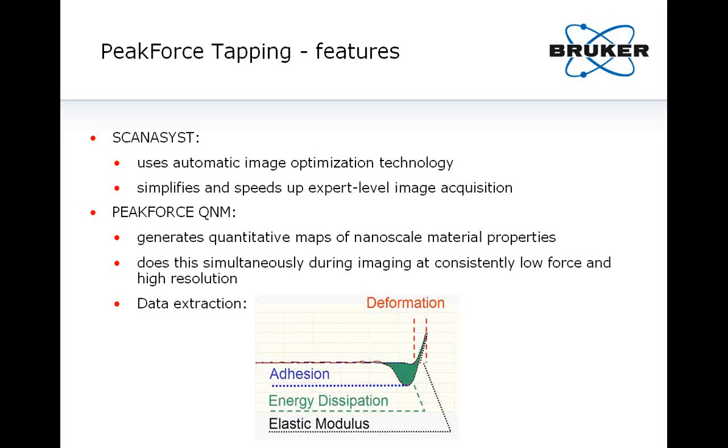So as in regular force mode, the adhesion is detected as the maximum step height between the baseline and the maximum adhesion, which is the minimum force. The deformation is obtained by the distance on the x-axis between the contact point and the turnaway point. The Young's modulus can be directly obtained by extrapolating the linear part of the curve.